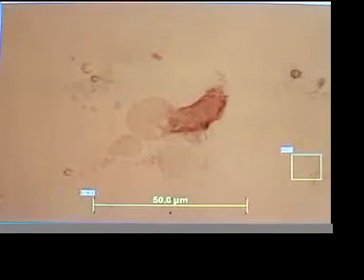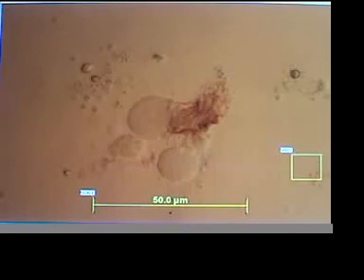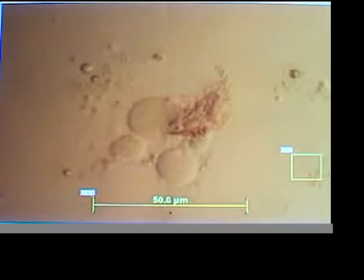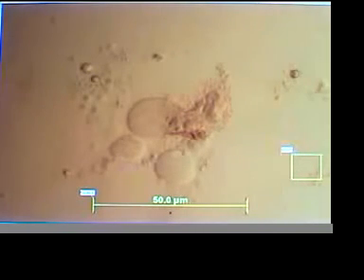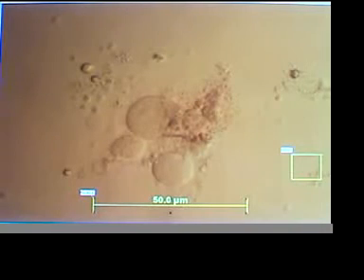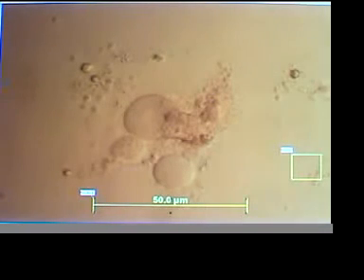Let's see if we can get a sort of a 3D profile effect here. Yeah, that's really nice. We'll try to focus that a little bit. Can you see that? You can see the surface beautifully in that. Very nice detail. It's like a differential interference contrast filter, but it's just a little bit of a red filter. And that was a devitalization at 928 hertz. And it had been running for about 500 seconds to get to that point.